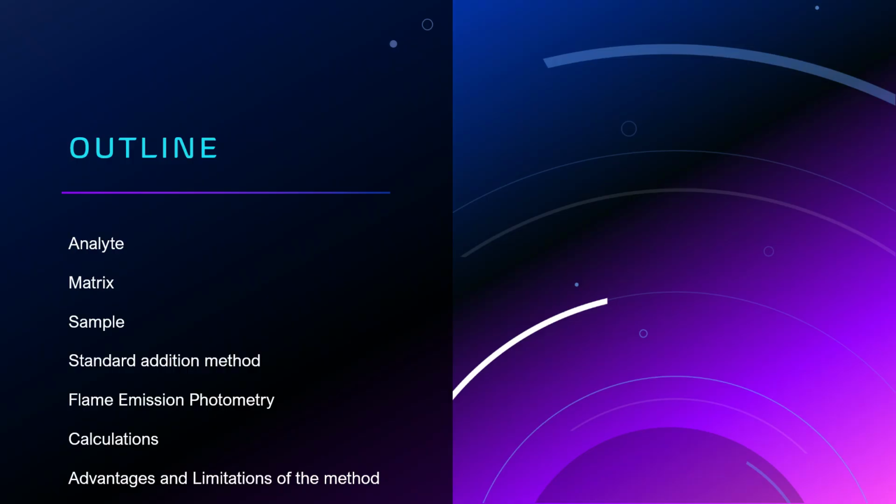This is the outline that we will be discussing today. In this presentation, you will be taught about the analyte, the matrix, sample, standard addition method, flame emission photometry, and the calculations related to your experiment. And then ultimately you'll find out the advantages and limitations of the method.